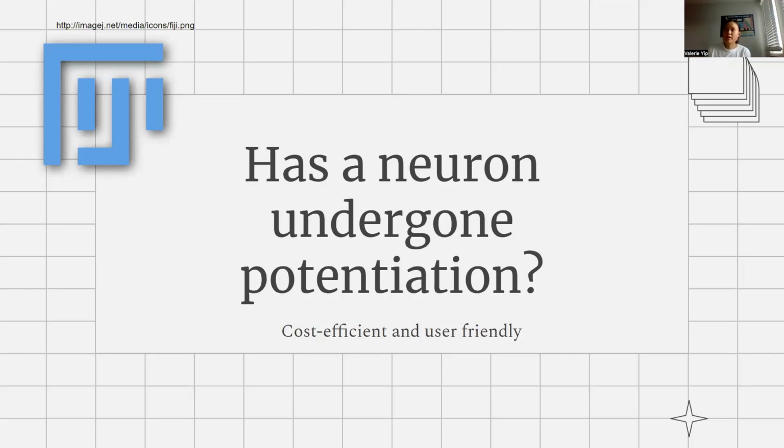There are obviously more sophisticated analysis pipelines out there that are more general and can do a lot more different things than my analysis pipeline could. But for the needs of this project and for my needs, what I had was completely fine. Overall, I just wanted to create a program that was easy to use, accessible and inexpensive, and that didn't require too many materials, just because I was doing TSI online, so I knew I wouldn't have access to that many materials.